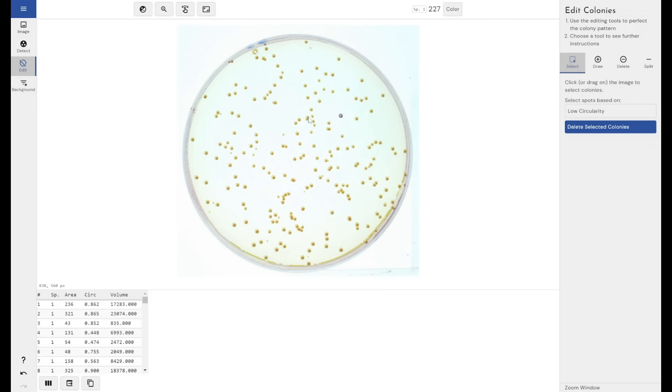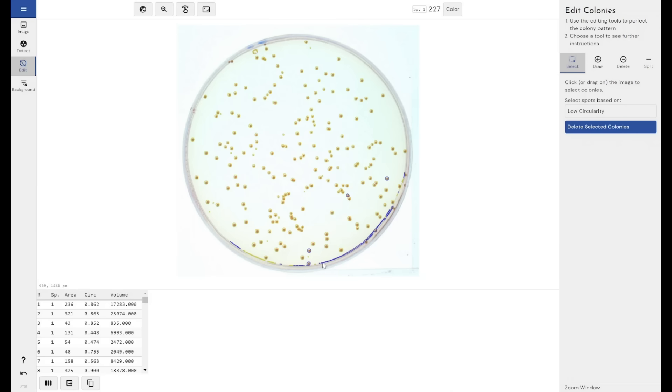Or you can detect automatically all colonies with a low circularity. If I click this, you can see it's detected these areas on the edge of the image, which is the edge of the plastic of this plate. It has low circularity, and I can delete those automatically.